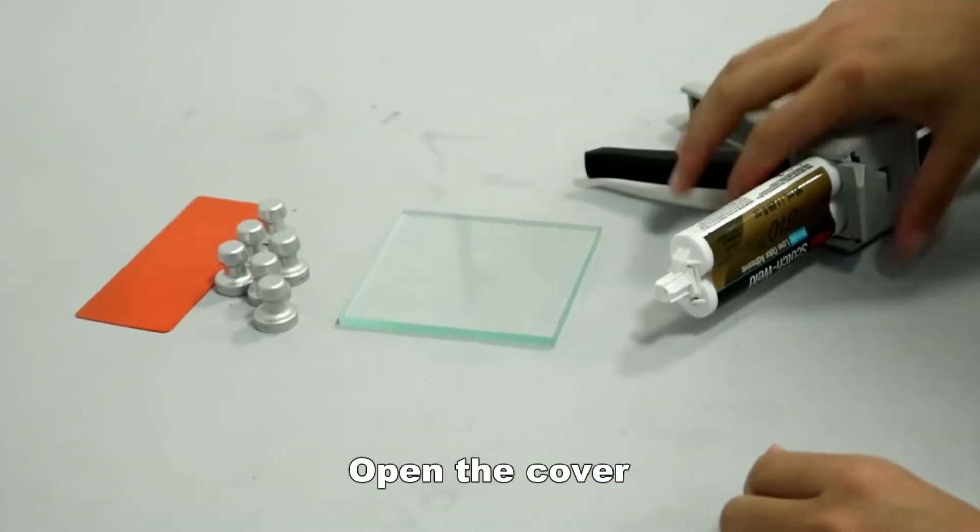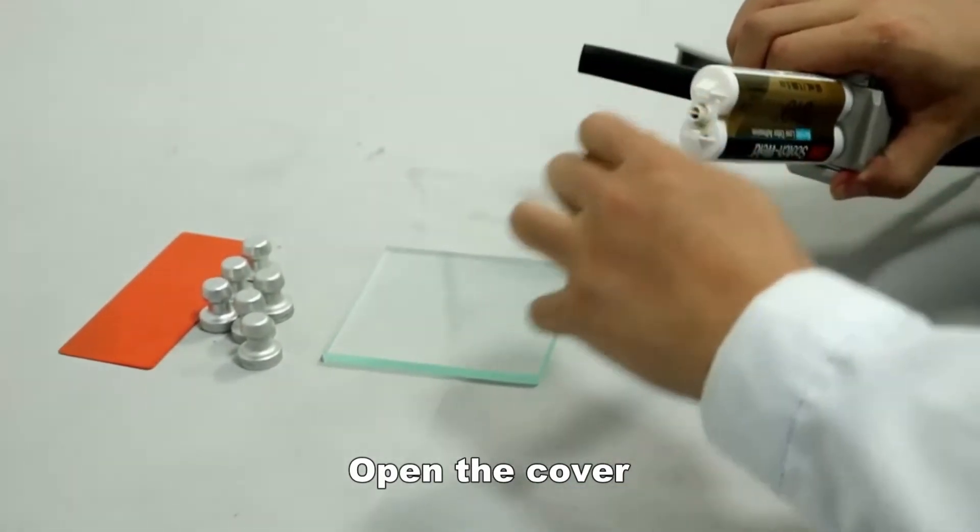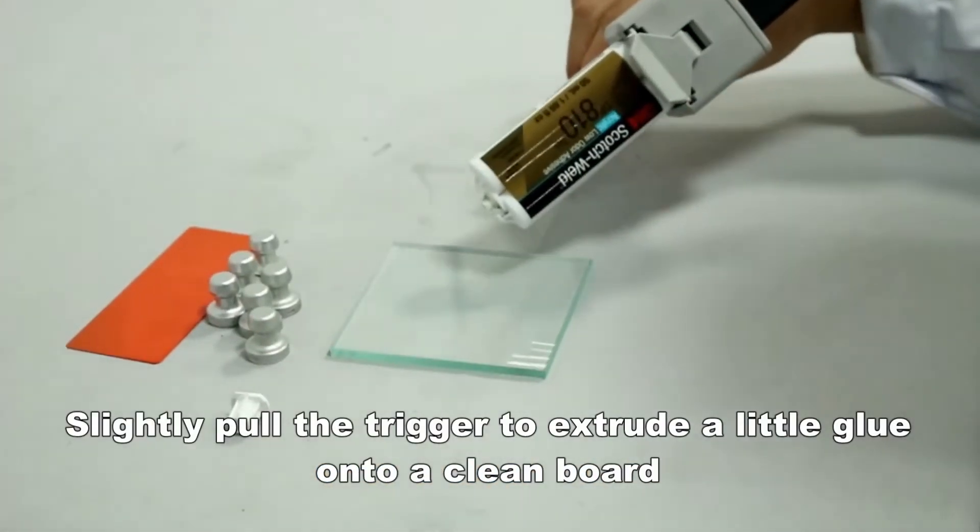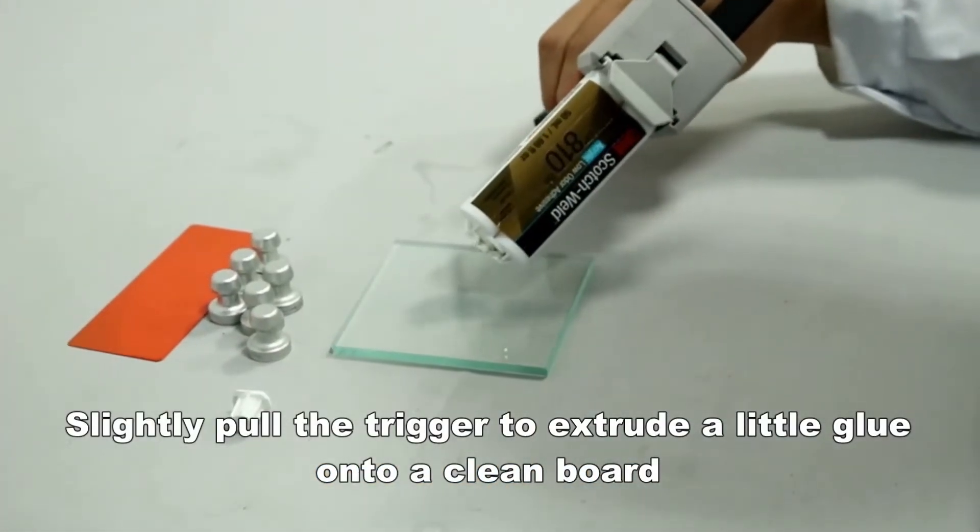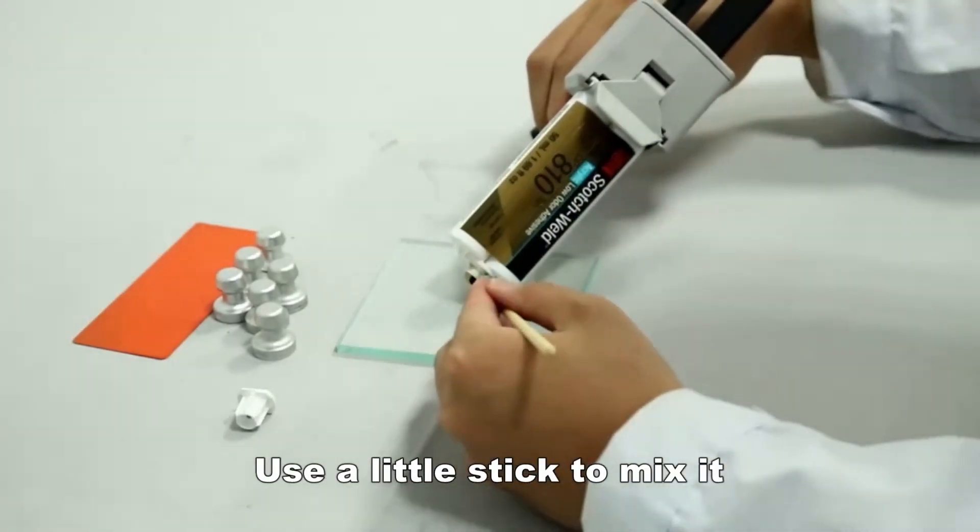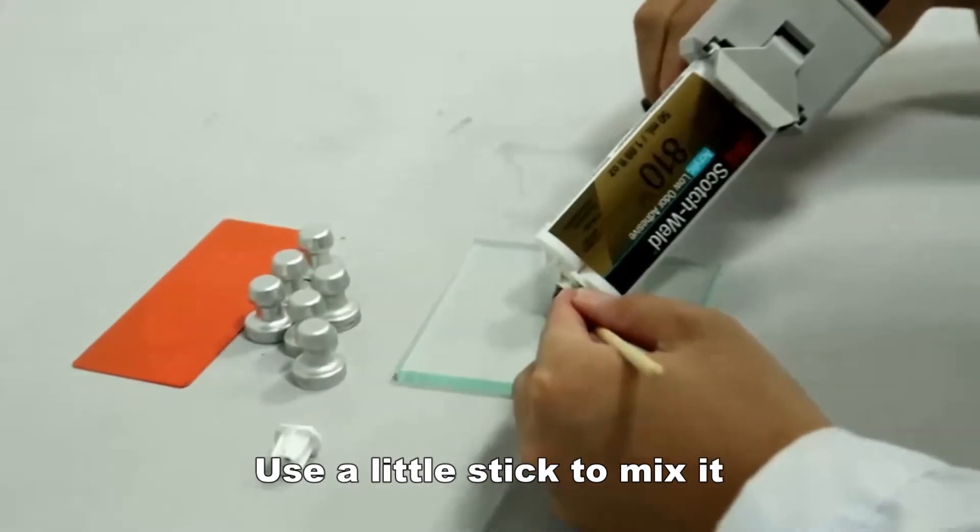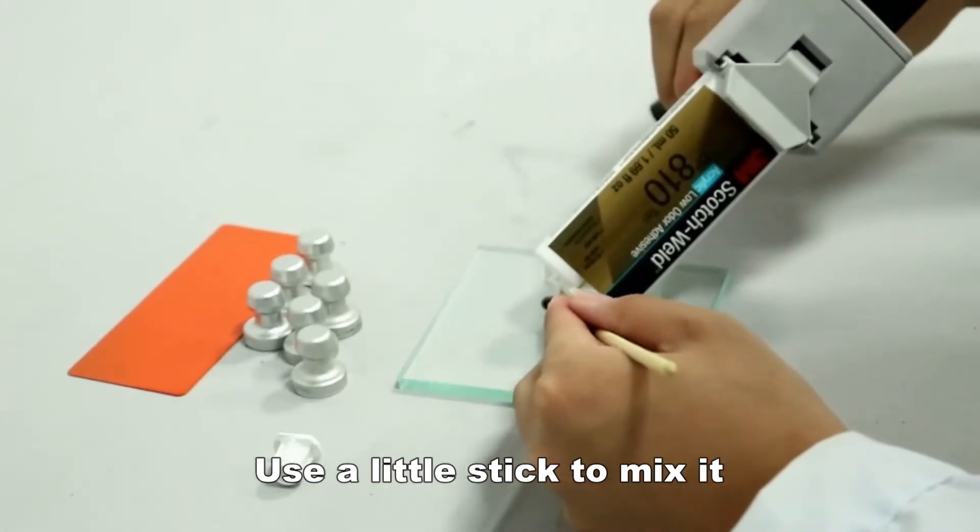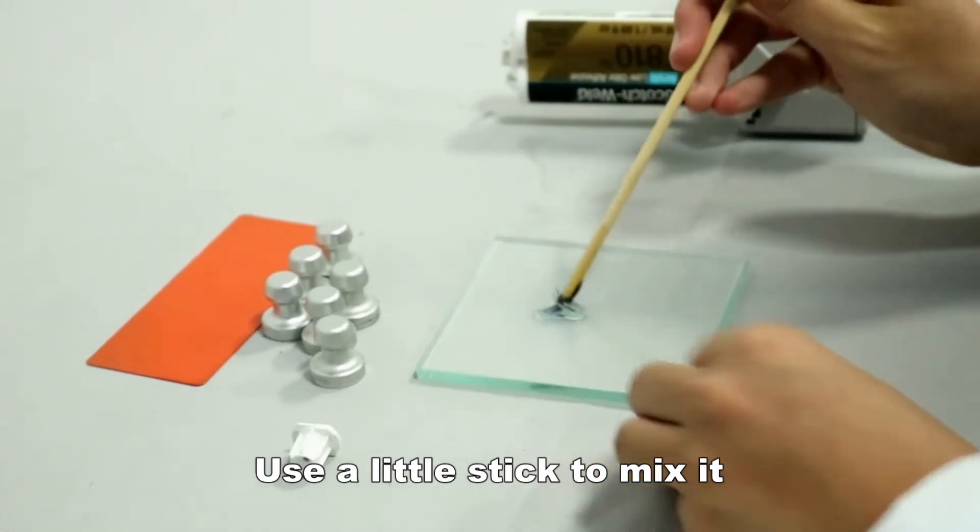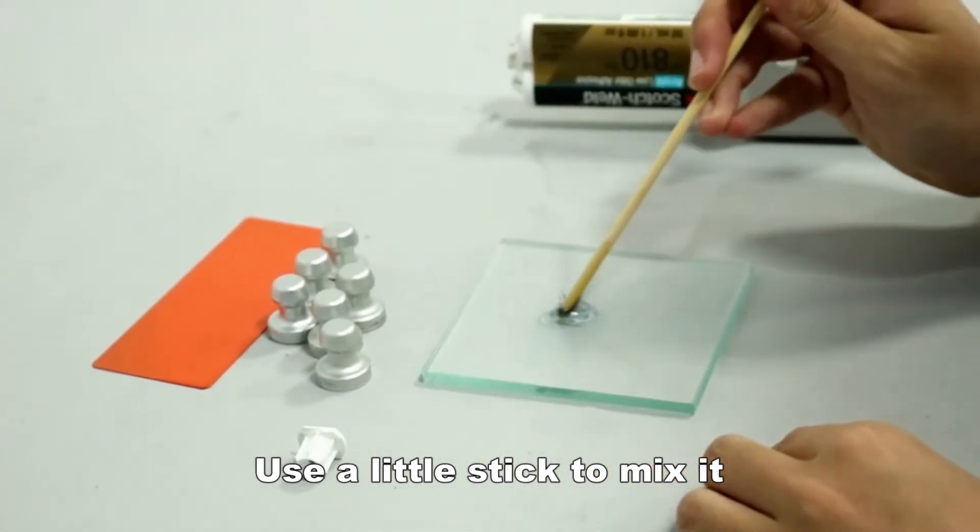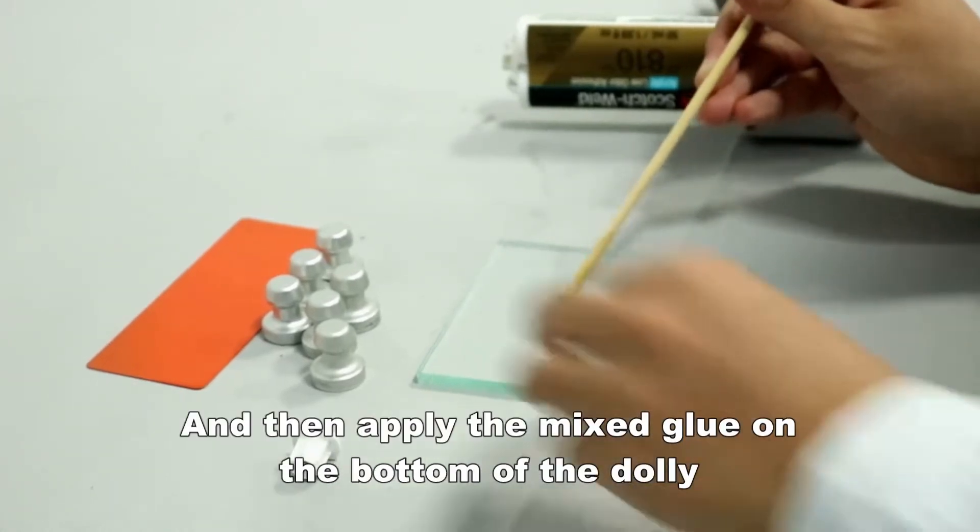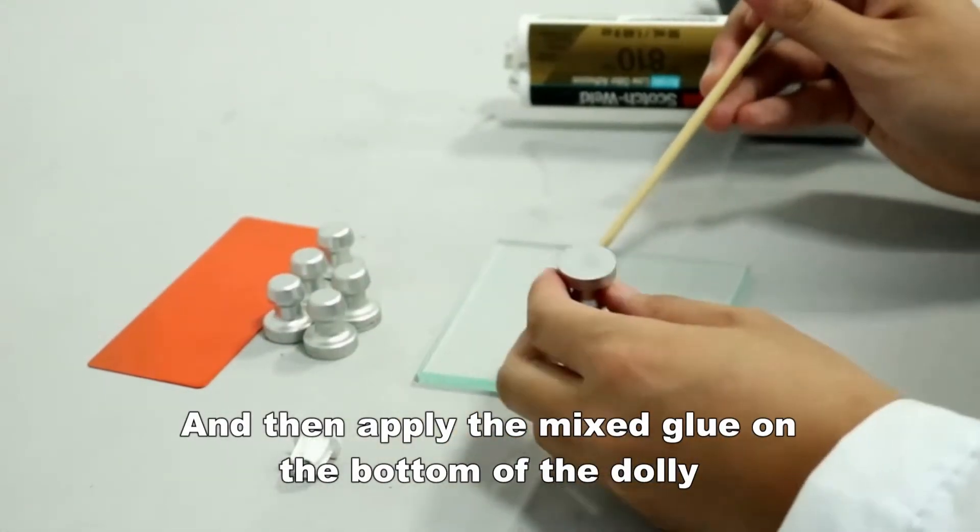Apply the glue. Open the cover. Slightly pull the trigger to extrude a little glue onto a clean board. Use a little stick to mix it, and then apply the mixed glue on the bottom of the dolly.